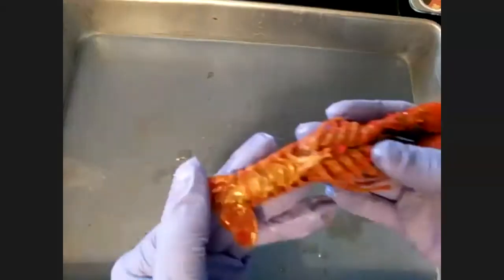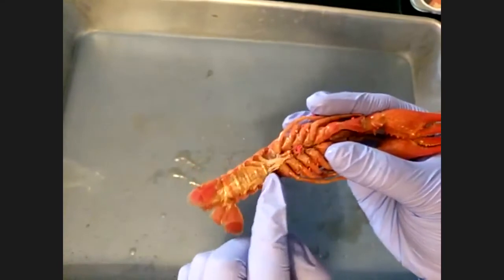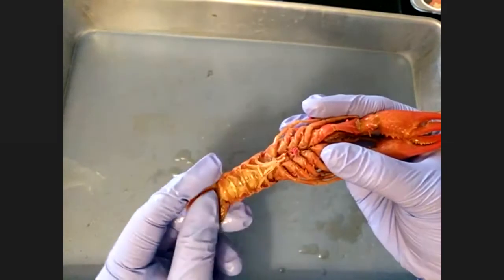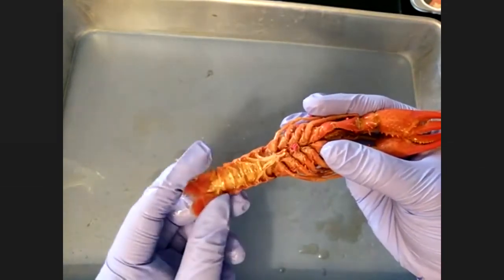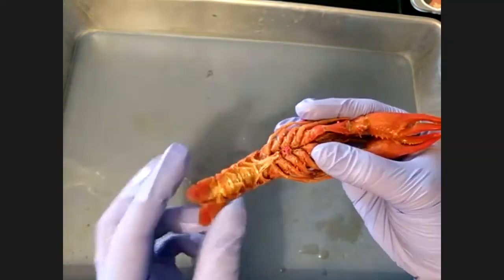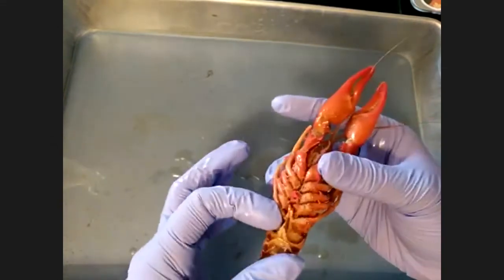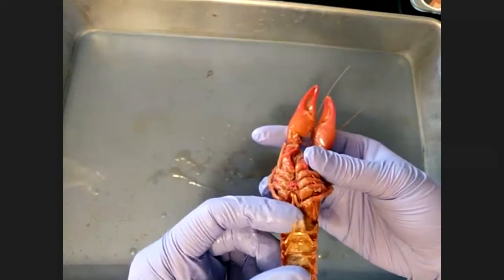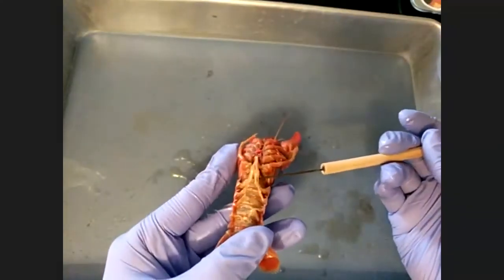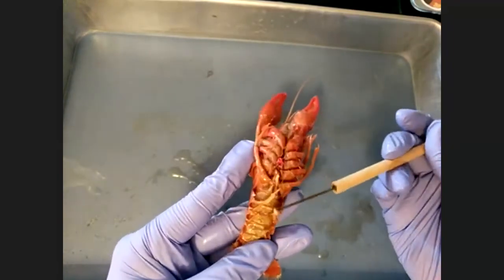And when we flip it on its back, we can see these little feet at the tail. These are actually called swimmerettes. They are not used for swimming. So swimmerettes is going to be something important to write down. The swimmerettes aren't used for swimming. They are used for reproduction. For females, they hold eggs. And for males, you can look at these two long structures, and that's how you can tell if it's a male or female. These two long swimmerettes are actually used to attach to the female and reproduce.